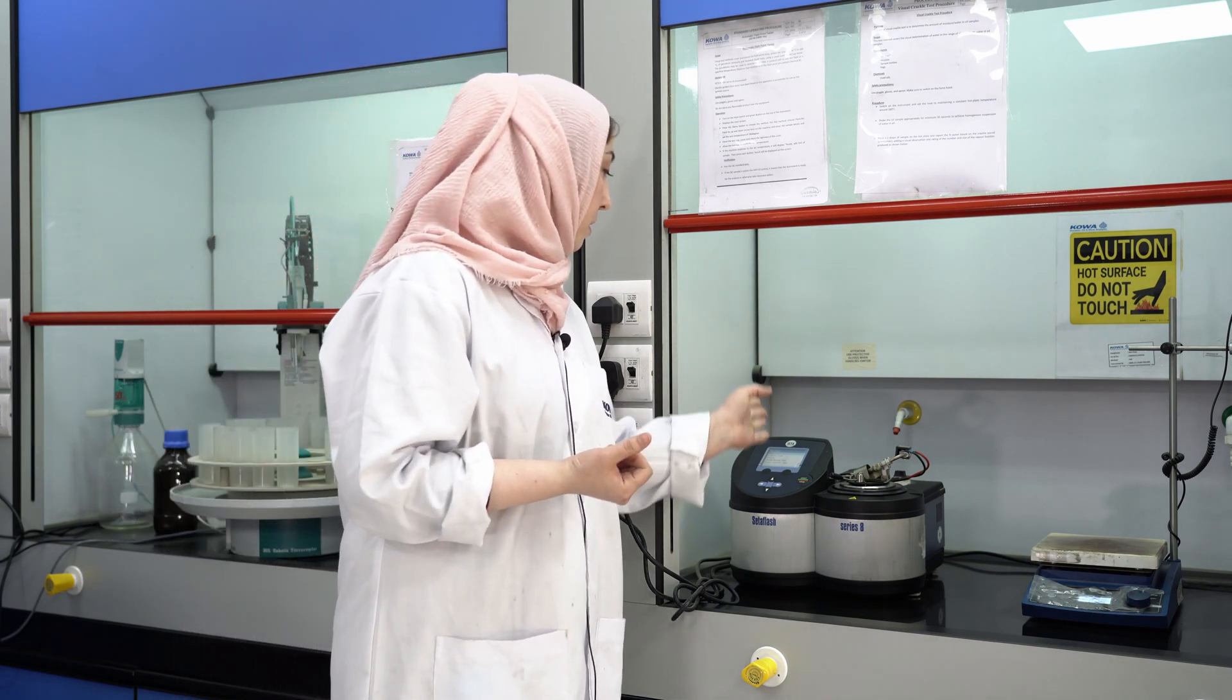So the dilution test, or fuel dilution test, is a measure of the quantity of fuel in the used engine oil by the method of flash point.